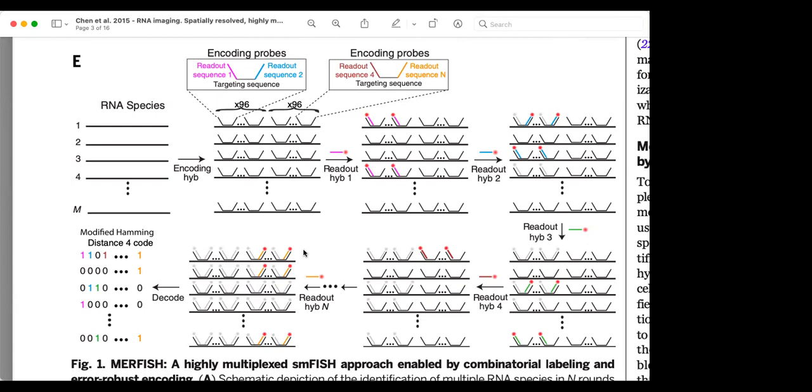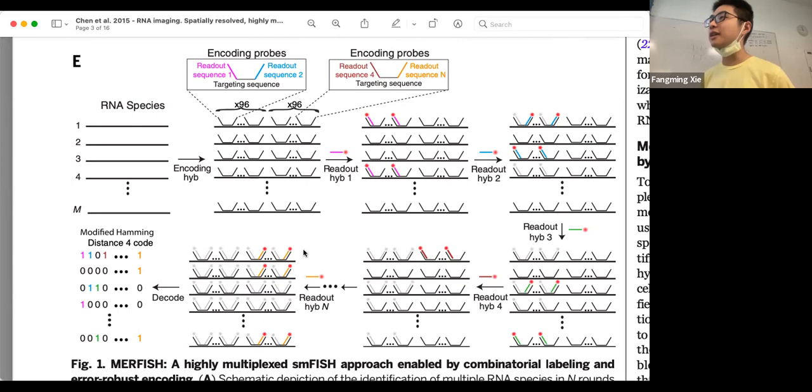And what is the advantage or disadvantage of using the same fluorophore versus using multiple? Oh, I think using multiple fluorophores is always better, if that makes sense. This is just assuming in each imaging round, you only have one color at your disposal, but you can actually do more colors. You can think of more colors as more channels in your bit system, without actually needing to image twice. But in the scheme, to avoid complexity, you just don't distinguish them. So repeated imaging can be replaced by more colors, if that makes sense. Got it, thanks.